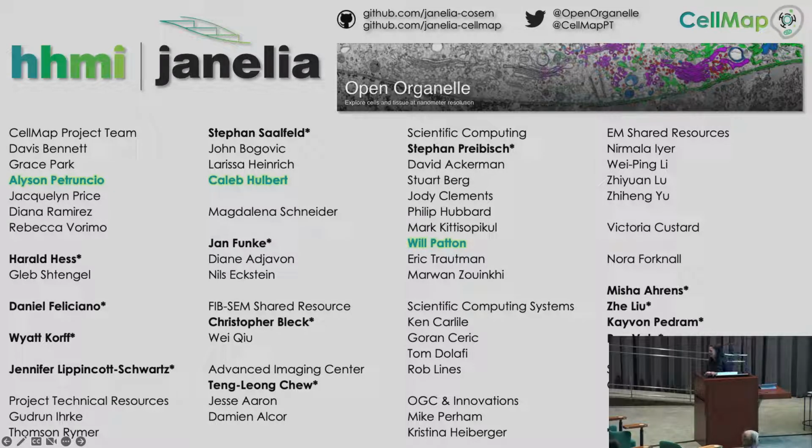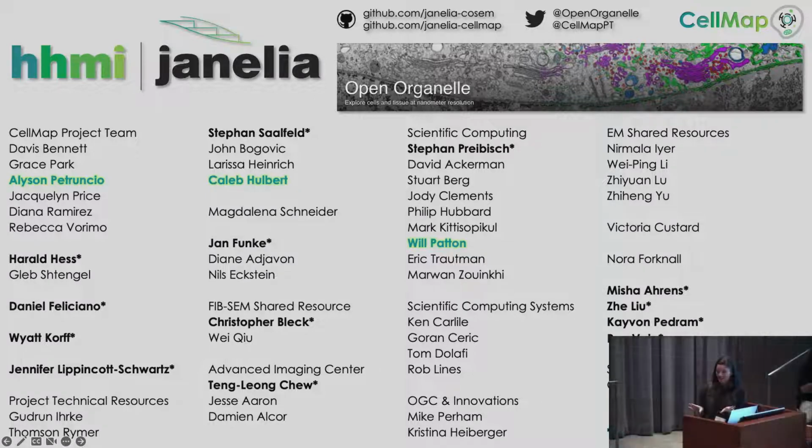So the question is, does this critically depend on high pressure freezing cryo-EM, or could you do it with some sort of chemical fixation? I can tell you anecdotally that our networks thankfully have been generalizable enough to not care too much. All of the data sets within the COSEM work were high pressure frozen cells on a cover slip, and then freeze substituted and prepared for FIB-SEM. But all of the tissue work, as you can imagine, is not, and our networks were able to translate over to them with some fine-tuning pretty straightforwardly. And we're working to constantly improve that.